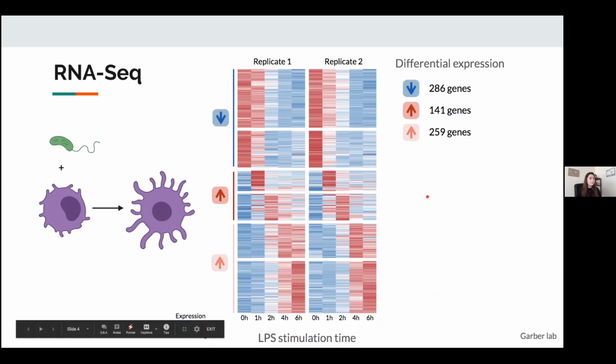So you can see that many of the genes in this heat map show similar patterns of expression. And the reason that it's so easy to visualize this in this heat map is that we actually clustered the gene expression by the genes that had the same response across time. So they're organized in this way, which you will learn how to do through Dolphin. And it makes it easier for us to pick out these specific expression patterns and responses.